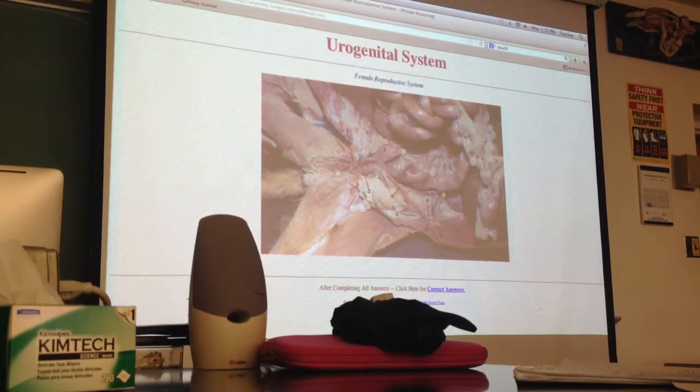All right, so to start, even though it's not on your list, I'm going to point out the uterus because that's the easiest structure to find in the female reproductive system in the cats, and it'll lead you directly to all of the things you do need to identify. So right here, this is the uterine horn. Cats have a uterine horn on either side of their body, and in this position, how we're dissecting down, they'll be sitting superficial to the kidneys. Here you can see just a corner of the kidney right here. So if you have a female cat, I recommend doing the reproductive system first so that you can identify all the parts and not accidentally rip through it trying to get through the kidney.